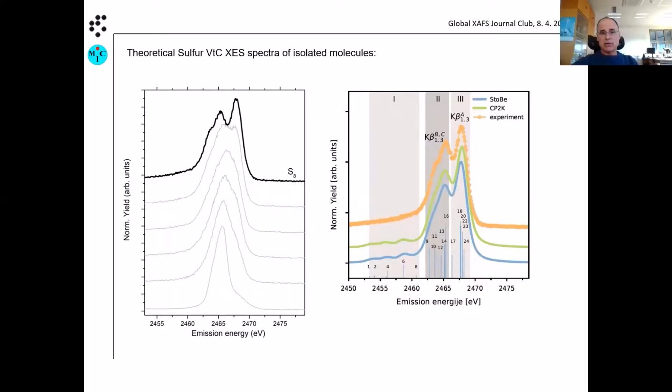For that, I show here the measured spectra. The black one is pure sulfur. This is the starting point, because this is basically the only sample which you can really trust is clean. With the polysulfides, you never know what is actually inside.